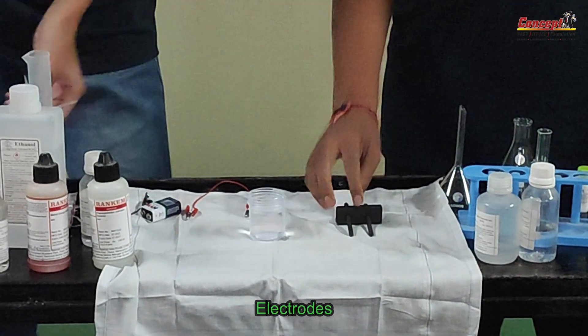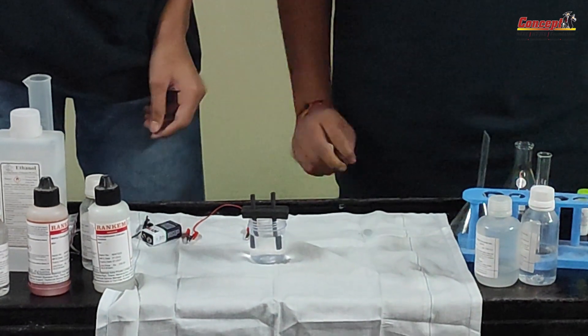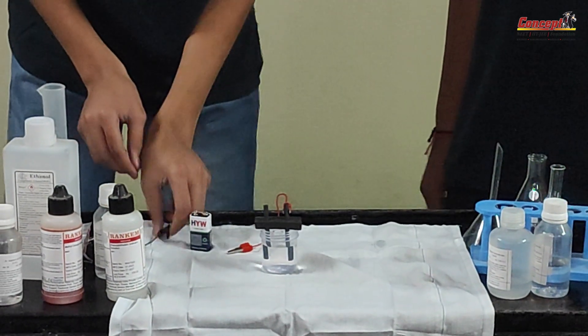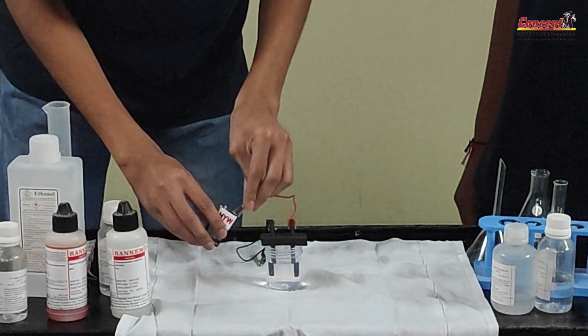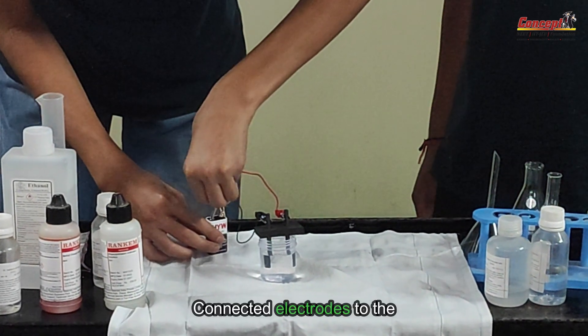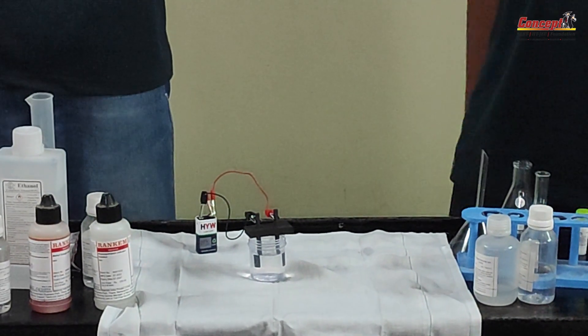Now take the electrodes and dip them in the solution. Take the wire and connect it with the battery — connect it to the electrode first. They have taken a small setup in which they have connected the electrodes to the battery's negative and positive terminals. Let's wait for some time.